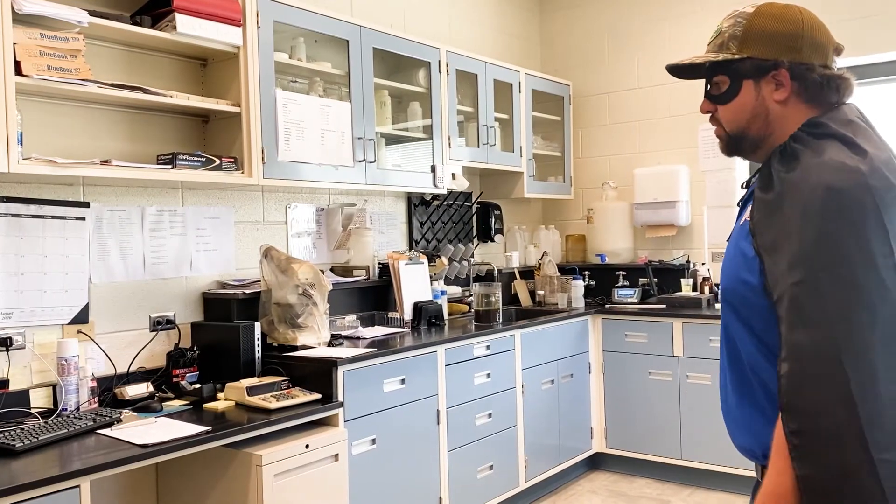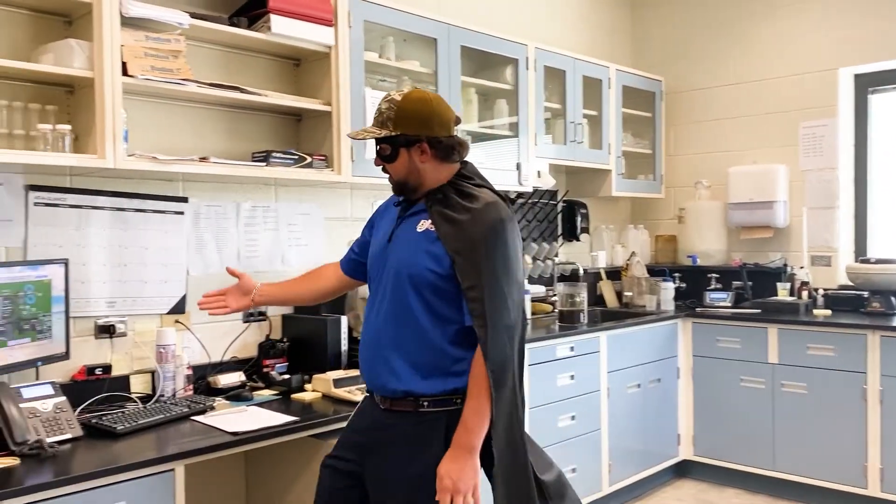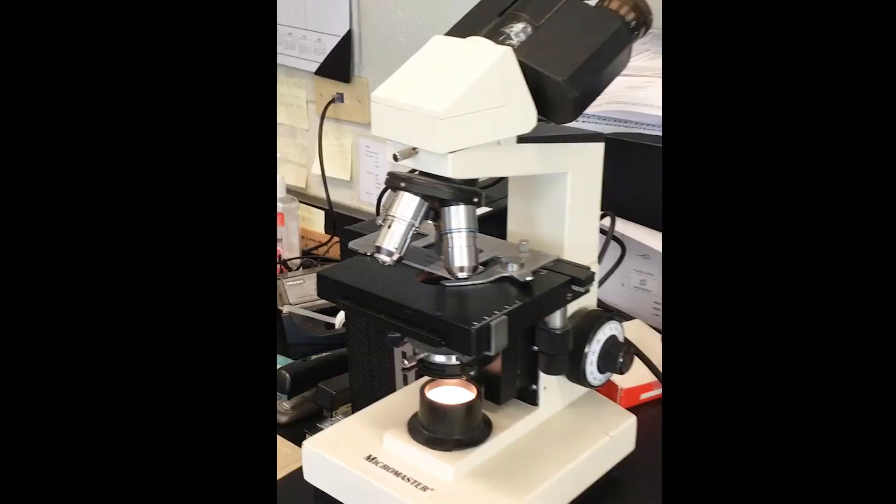This is our wastewater lab. We run all of our process control samples. Over here we have our plant where we can control the plant on the computer and monitor it at all times throughout the day. We have our microscope where we look at all the bugs that are eating the bacteria within the plant.